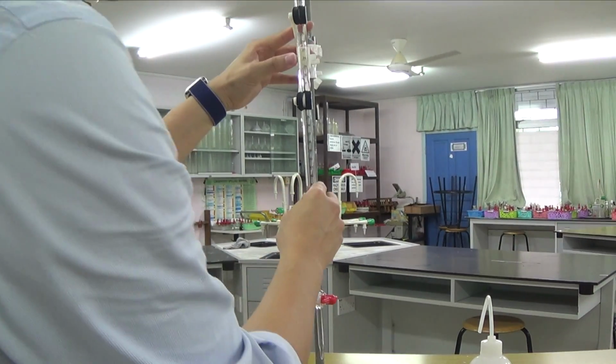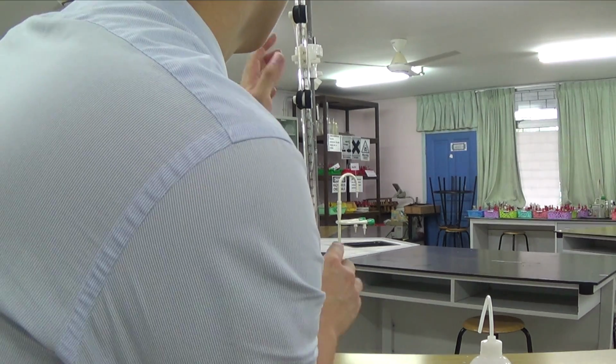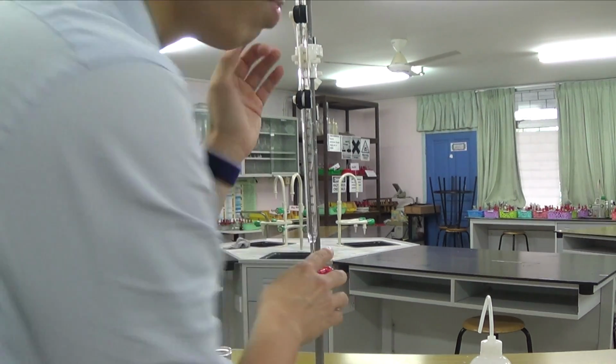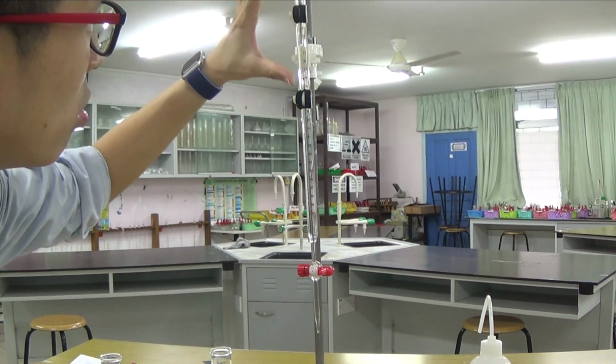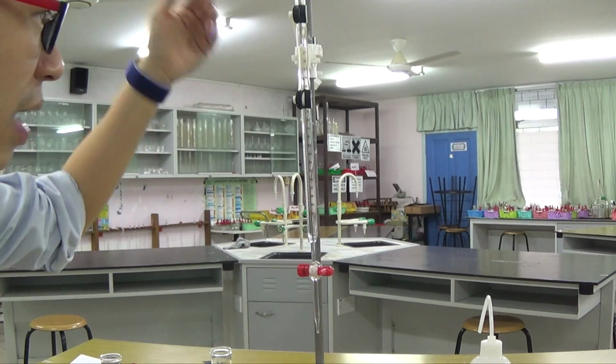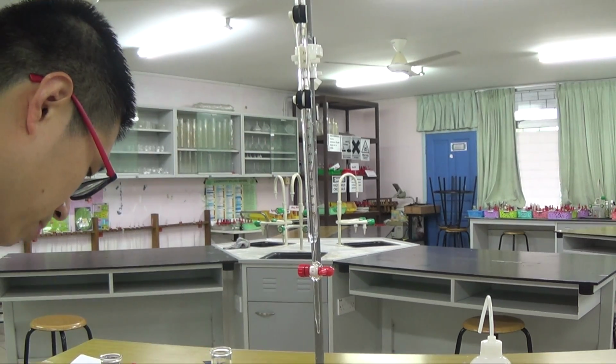So I'm starting from the exact volume where I left off, 21.9. And we know that is acceptable because it was around 20 something, plus 21 is still going to be 40 something. I still have enough on my burette. So I can start from 21.9.